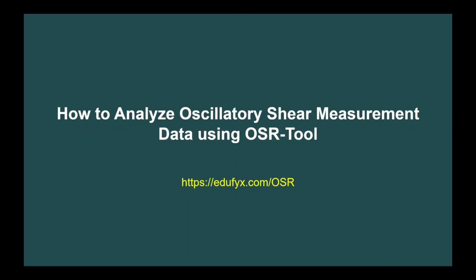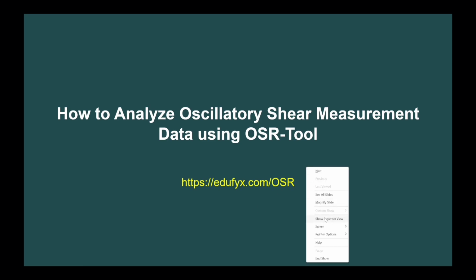Hello, in this video I want to show you how to analyze oscillatory shear measurement data using OSR-Tool. You can access OSR-Tool at this URL.